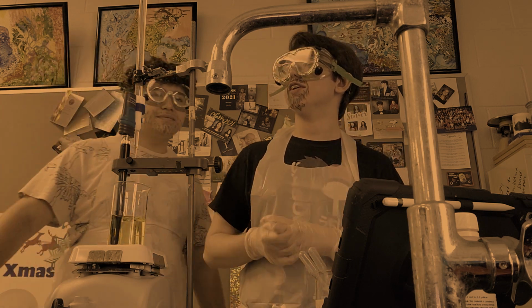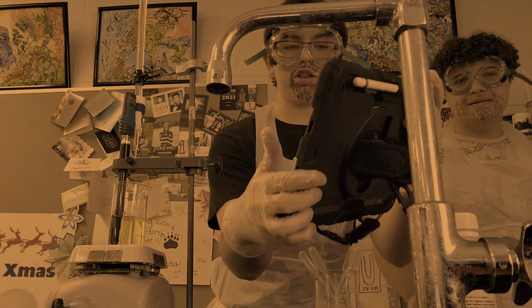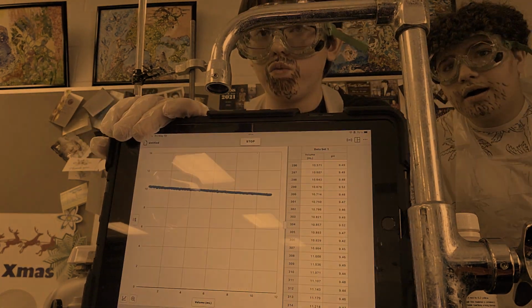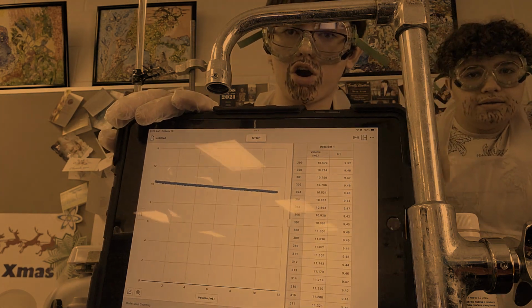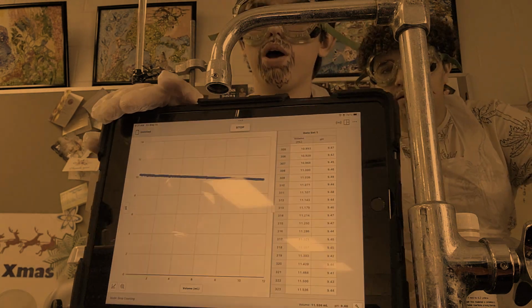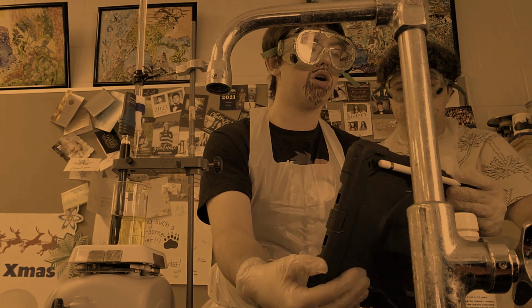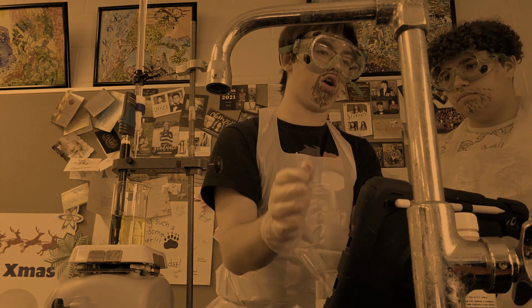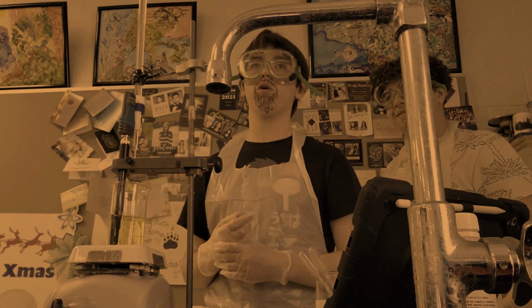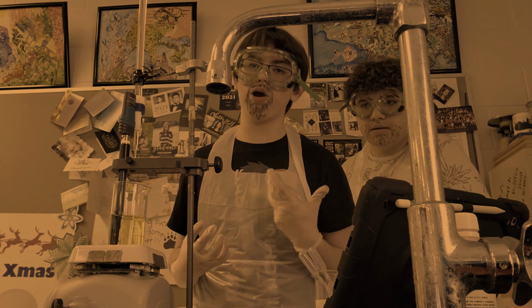Not that sensitive. Okay, so Jesse, if we're looking at this graph, as the titration progresses, we are slightly getting closer to having our pH lowered because it's going strong down, the acid, Mr. White, and the burette is going down. But it just so happens that our pH is currently 9.4. Well, we hypothesized much lower, specifically 8.8 for our pH at this point. That's higher, Mr. White. So, we've now found that there are some statistical variations in this experiment.